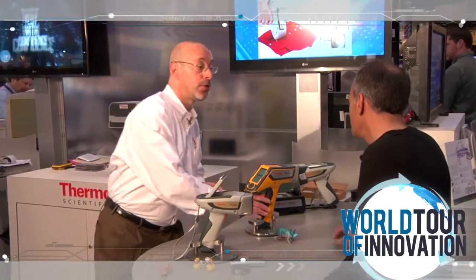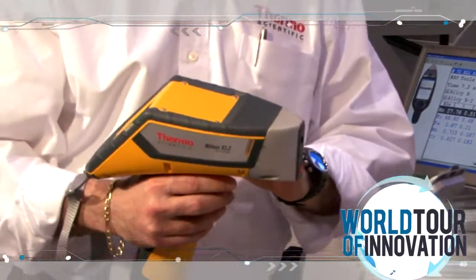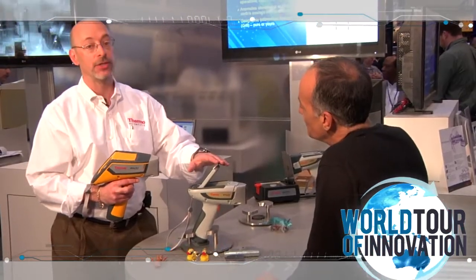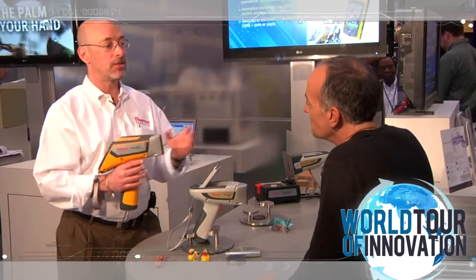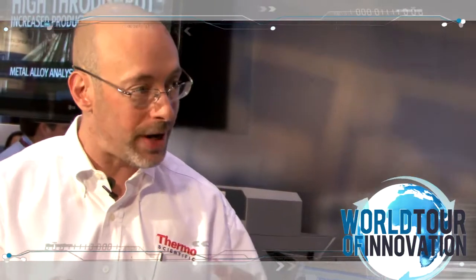And so what we have here, Keith, is the all-new Thermo Scientific Niton XL2. This is the product we're debuting here at PitCon — the first year it's been shown at PitCon. Where the Niton XL3 expanded the capabilities of XRF, this one expands the market to where more routine measurement needs to be taken in the field. We're helping our customers, many of whom purchased instruments many years ago, upgrade their technology so they can take faster measurements, get better accuracy, all in a very easy-to-use package.